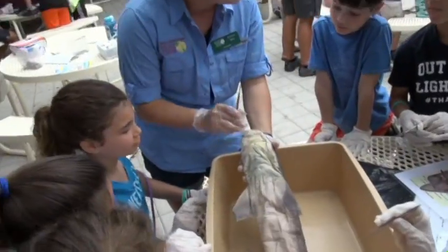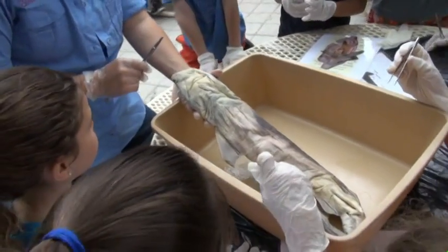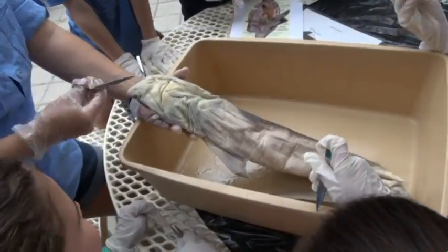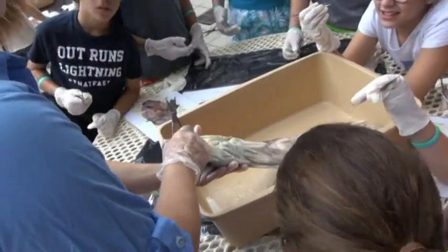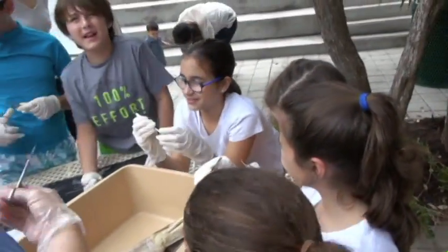What would be the only part of a shark remaining you would see after a while? Like after 100 years? What's the one bone in his body? Teeth, right? If you go to a museum, you're not seeing a shark skeleton because it's cartilage. You're seeing the teeth. That jaw is what you're seeing because it's solid. Teeth have a lot of calcium.